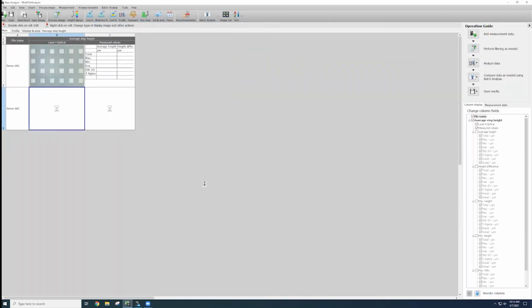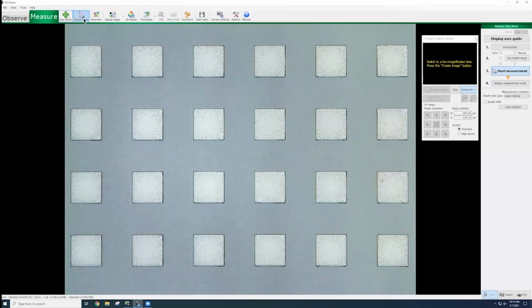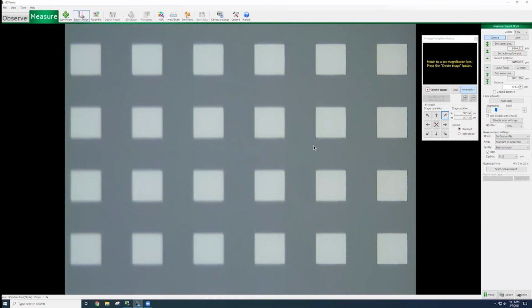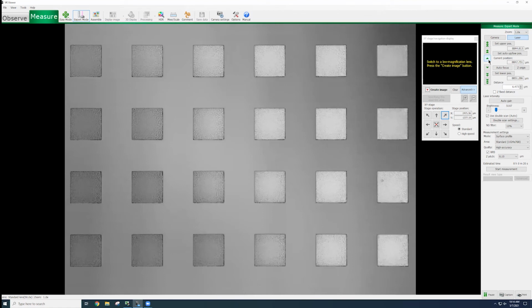I can dive into a little bit more manual setting. There's an expert mode, is what they call it. With the expert mode, I typically like using the laser setting. So rather than using an optical camera, for example, it switches to the laser. And here, basically, I can specify on my own what my height settings are, my limits.